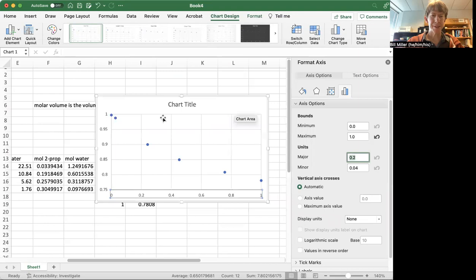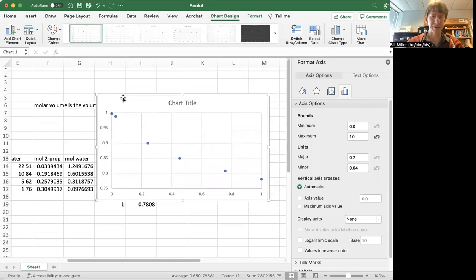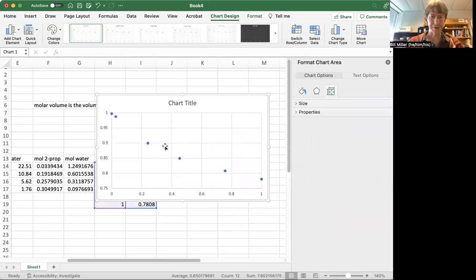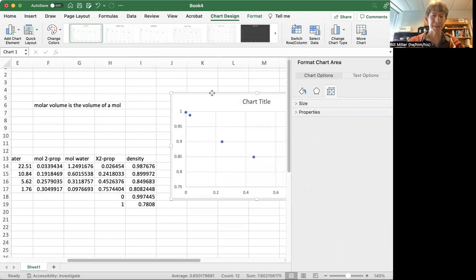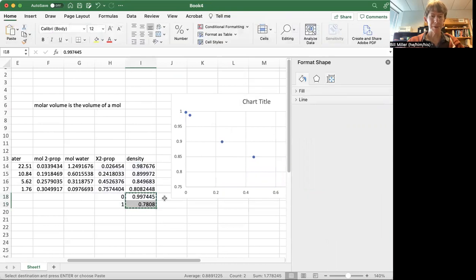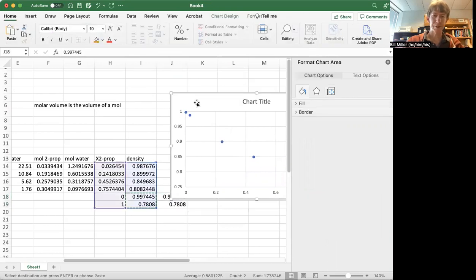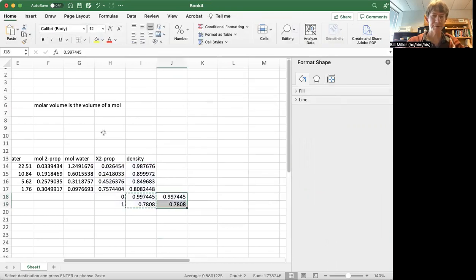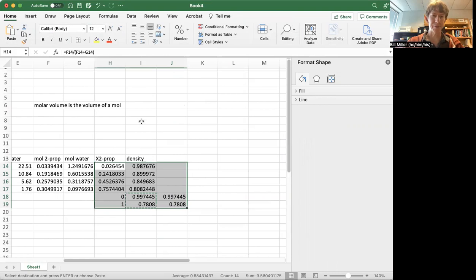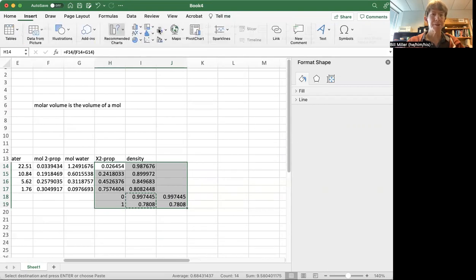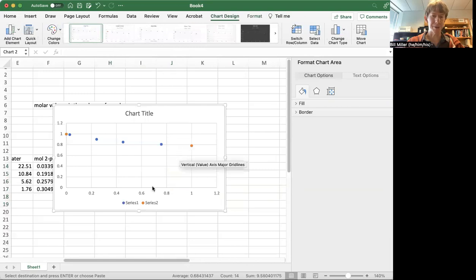And that's what my data looks like. And you can see there's a little bit of a curve there. This is what I can do. I'm going to copy these two points, get rid of that graph. And now I'm going to graph all three of these columns, because I want a separate line for my linear trend between the two of them.